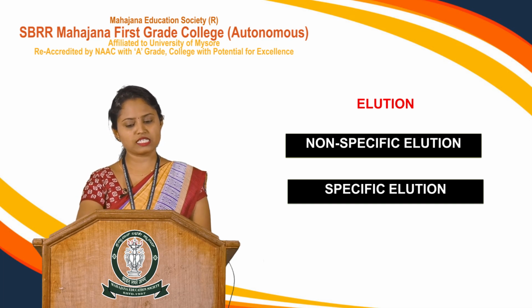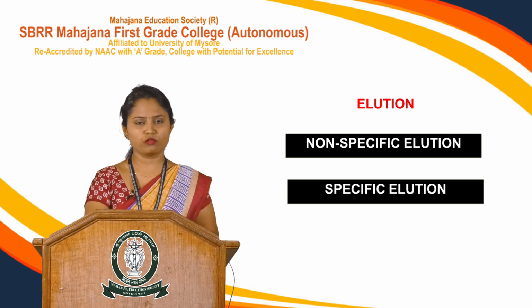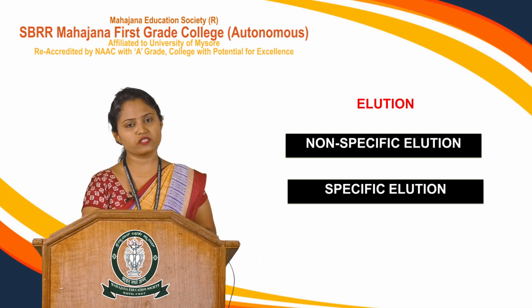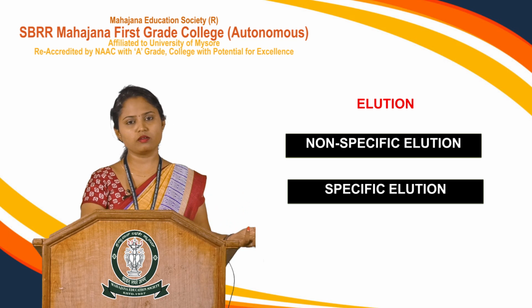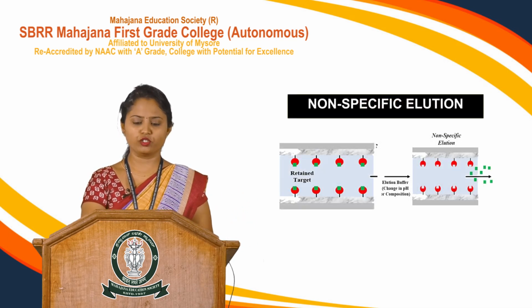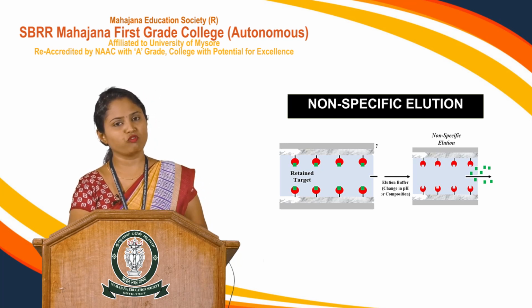Since the names say non-specific and specific, let us see the first mode of elution, that is, the non-specific mode of elution. This non-specificity means that you are not going to use any molecules which have more specificity than the previously bound analyte or targeted molecule. In this method of elution, you can look into the slide. We have a procedure wherein we have already performed affinity chromatography where the molecule is already immobilized on the surface of your gel matrix.